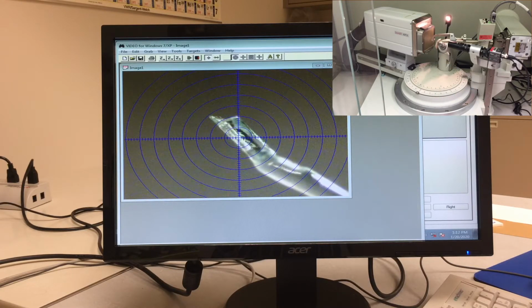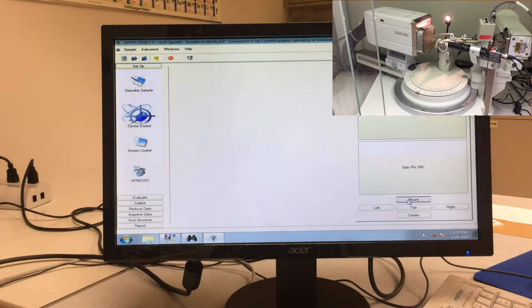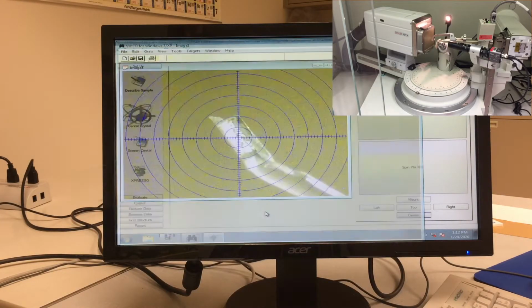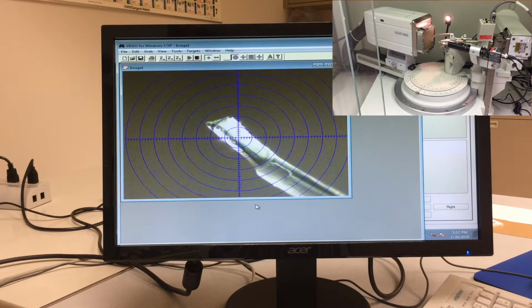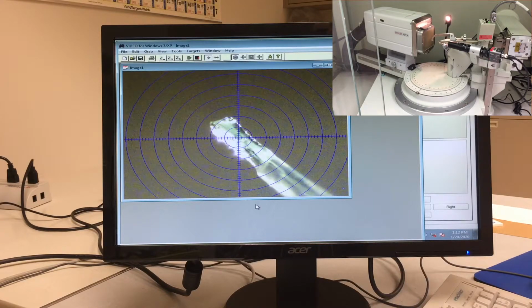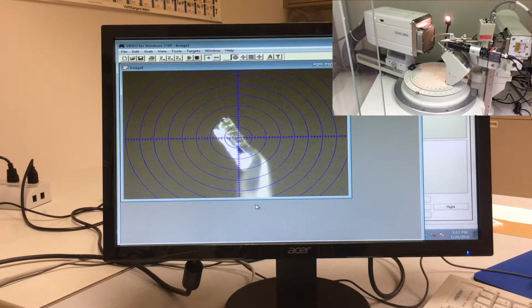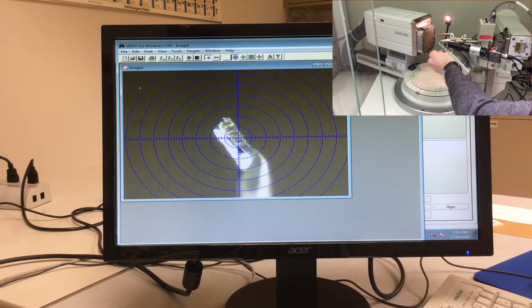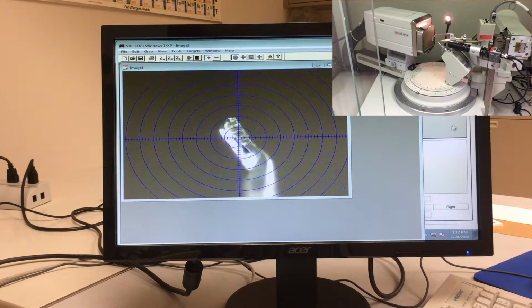And then another useful view is to just spin it over to where the goniometer is right under the camera. So that is the center command. So that will bring the crystal around so that the phi axis is rotating and is just right under the camera. And you can check to see how far off the omega angle is rotating around the axis.